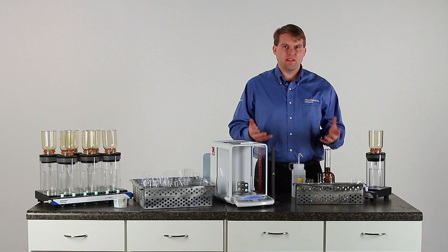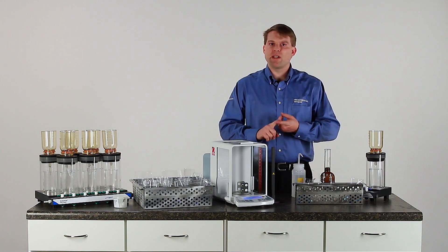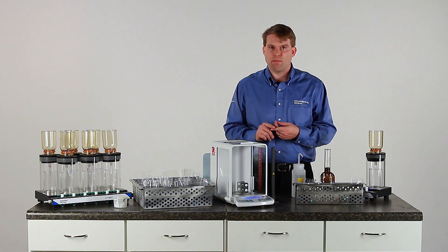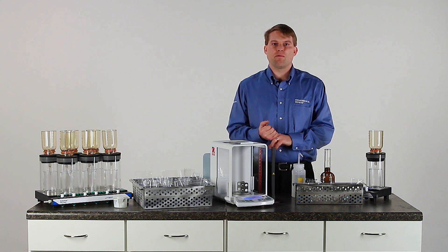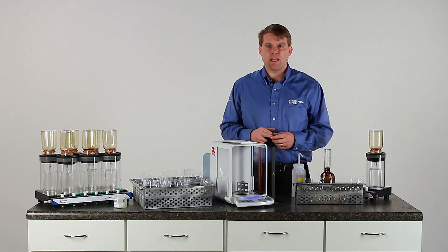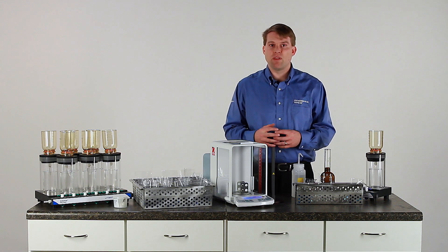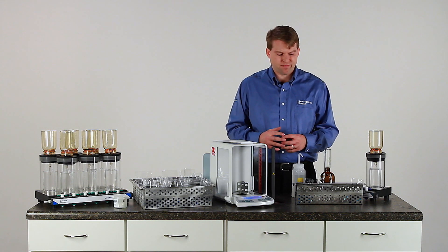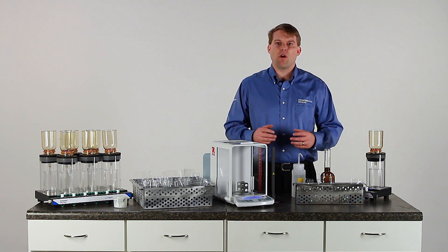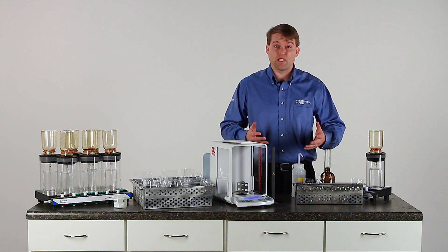As a quick review, when using the Stable Way products from Environmental Express, you save on the preparation of your vessels — they come pre-weighed and ready to use right out of the box. You will also potentially save on the drying and weighing steps, as you should be able to achieve constant weight much faster than with the heavier crucibles. The weighing bracket, the oven rack, and the filling stations are all accessories that will help you use these Stable Way vessels to their fullest potential.